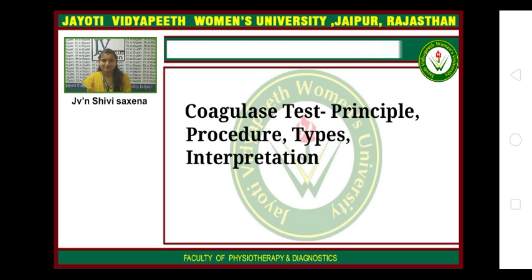My topic today is the coagulase test: principle, procedure, types and interpretation. Useful for MLT students.